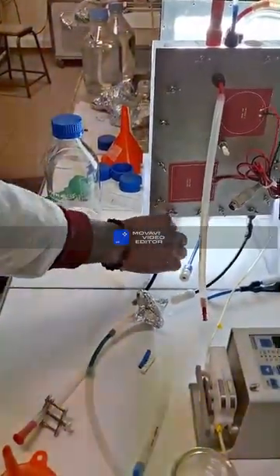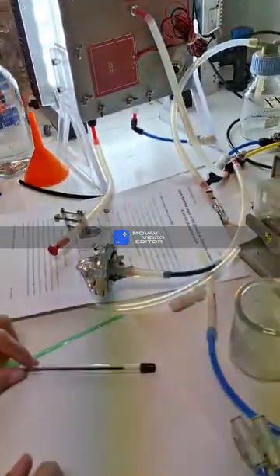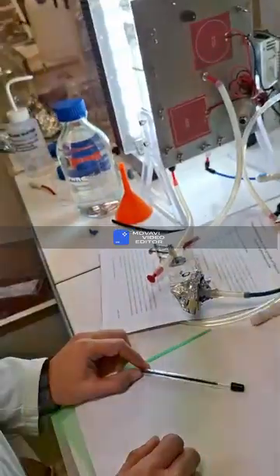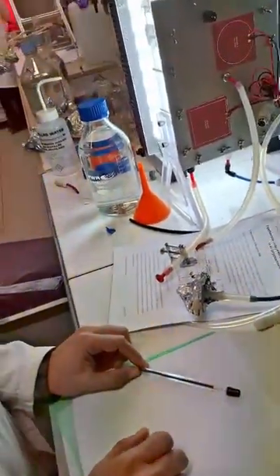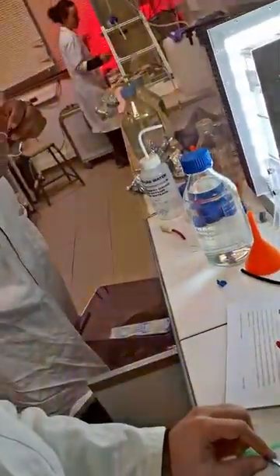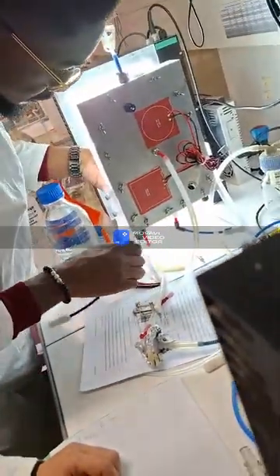Do you have a question? The arrow for the flow direction. So which way do we put the air inject? So you have to put it in this direction. And after, do something like this. And another part like this here.